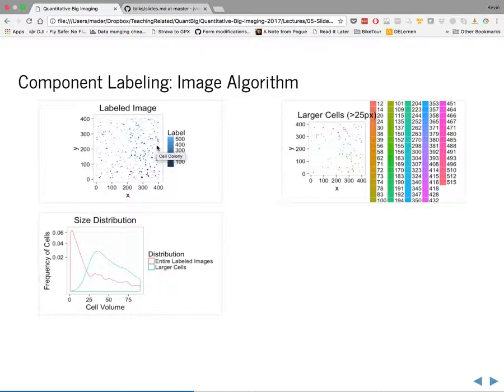Edges. Well, at the edges, I think morphology would tend to do worse because you don't have as much neighborhood information for the things at the very border. So with things on the edges, component labeling might work a little bit better. For counting and correcting for them, there are some different things you have to take into account, but typically that's not a huge issue. Yeah? When they're too close together, it might clump it all together into one big.